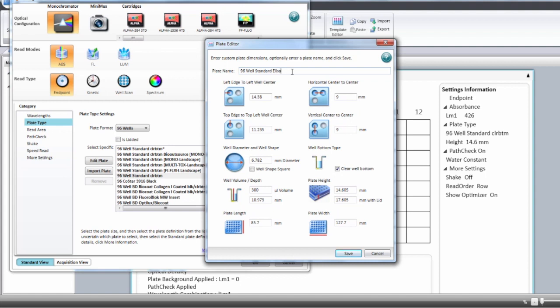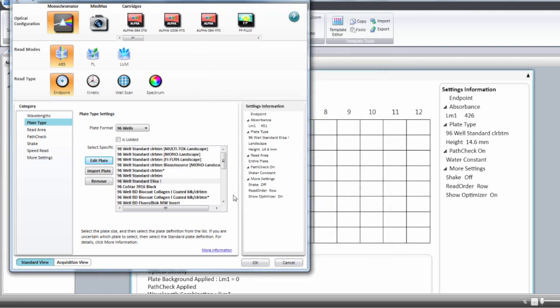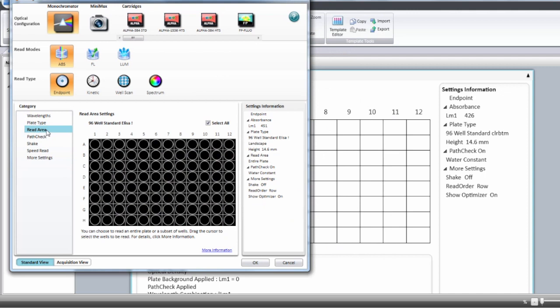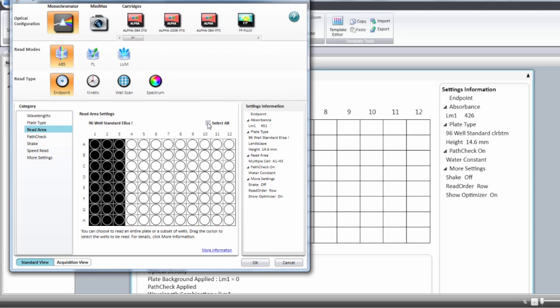You can then change the dimension of that plate to correspond to the plate dimension you have. Then you have to define the reading area and you can either select a portion of the plate to be read or you can select the entire plate.